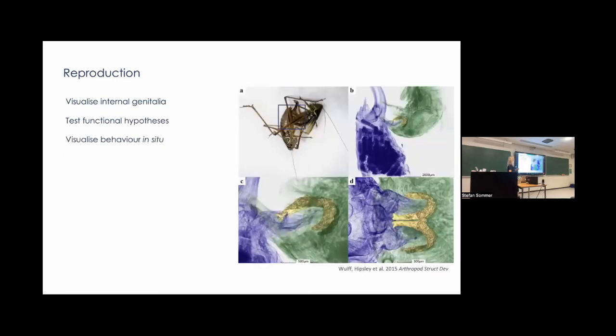And so, sorry for these poor crickets. They were in a colony, and while they were copulating, they were flash frozen. At least they would die happy, I hope so. And so then we CT scan them. So this is the female, she's full of eggs. That's what all these structures are. That's the male, and then in yellow are his paired titillators.